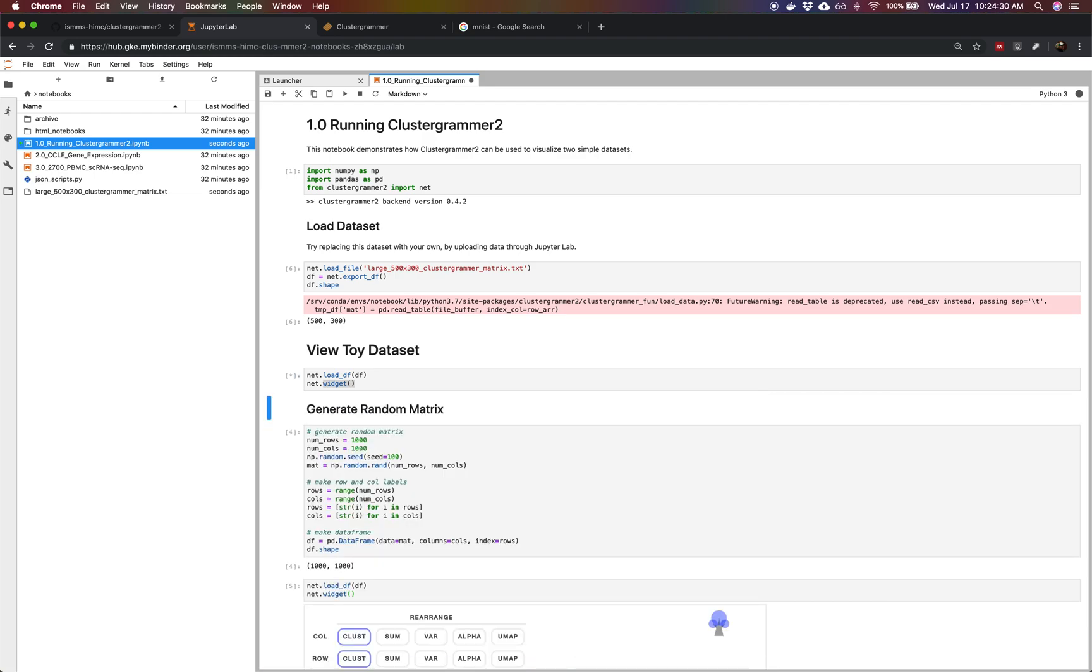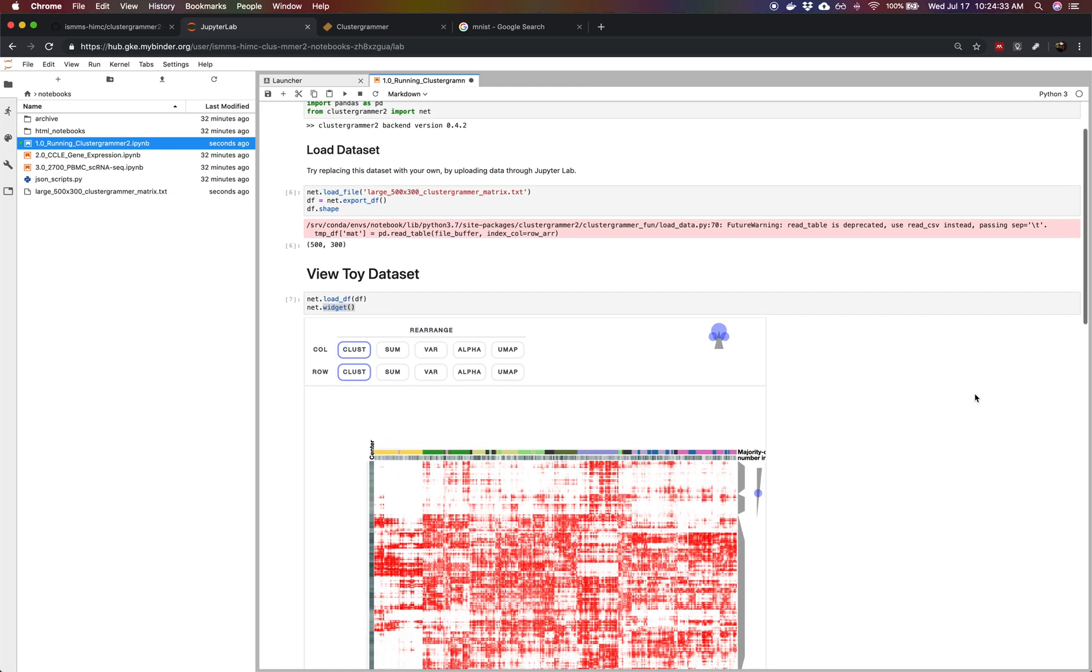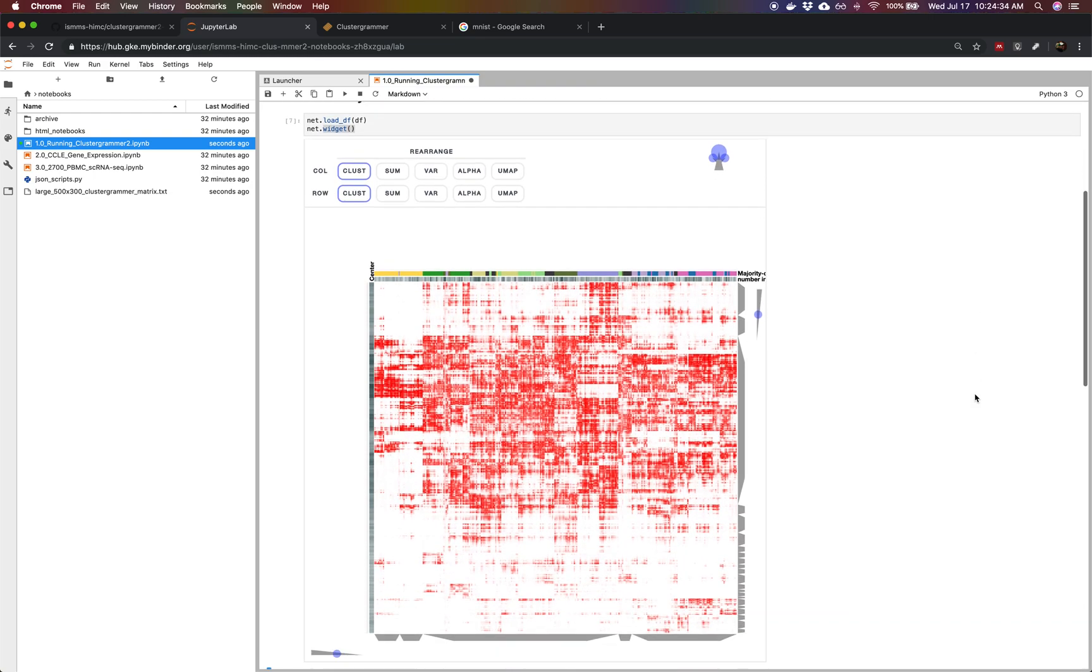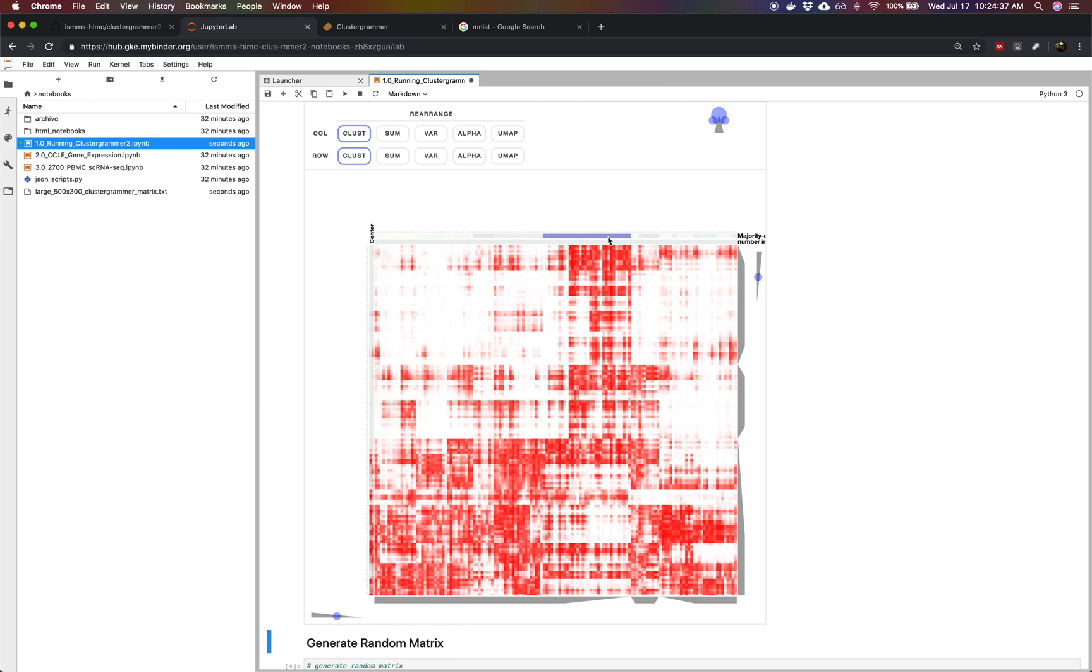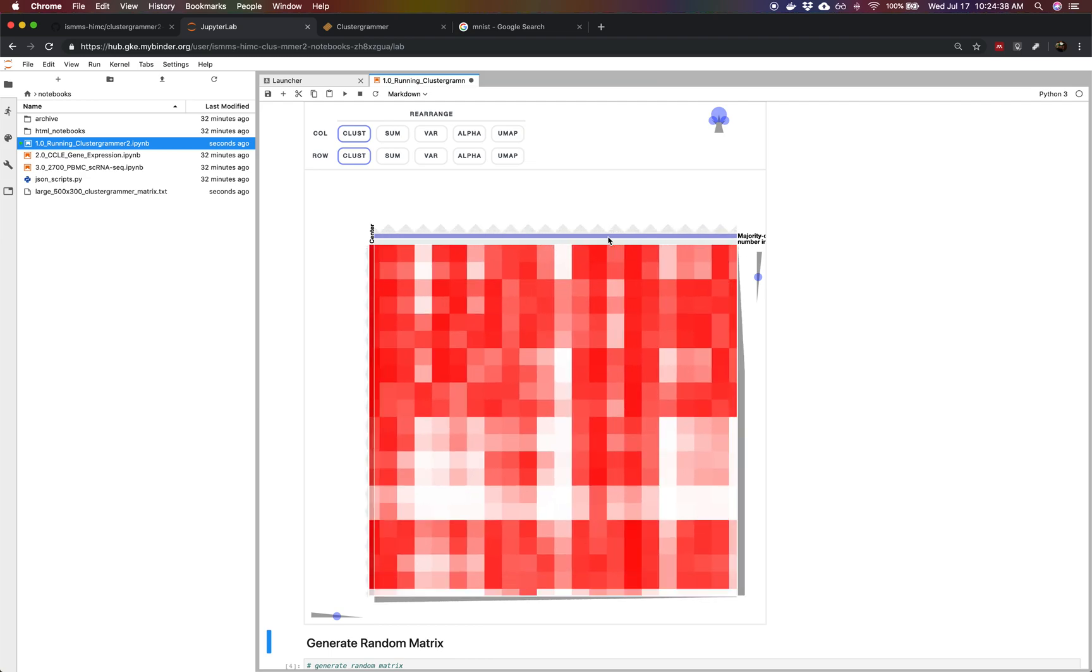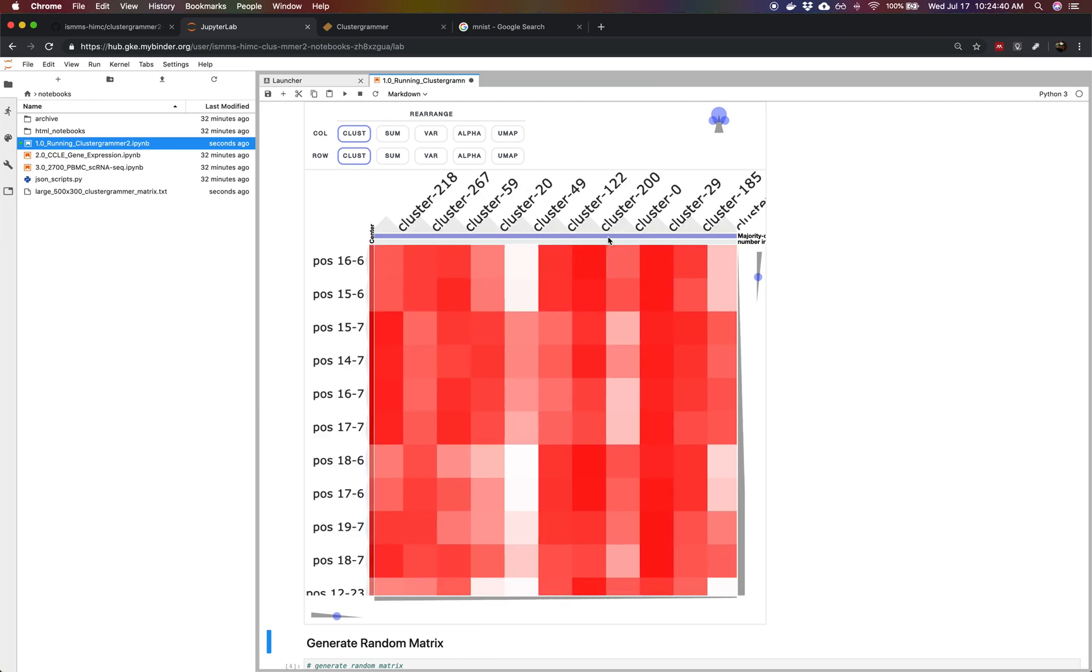We're going to visualize that dataset. Now we're reviewing our own customized data. This shows you how you can use MyBinder to actually explore your own data without having to, it's basically a little mini web application.